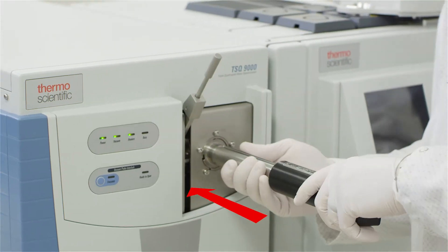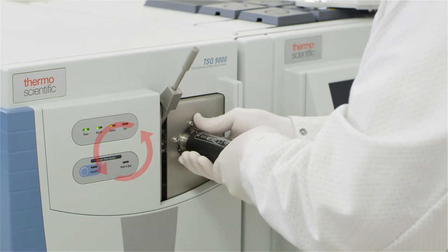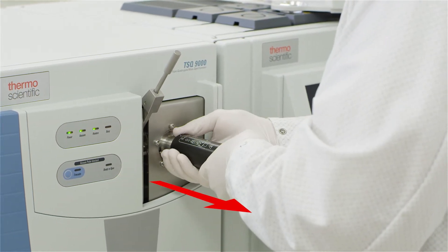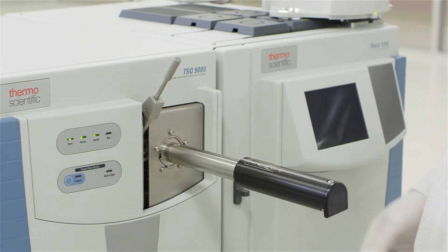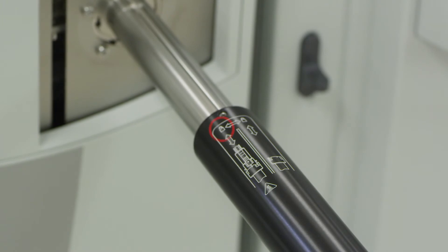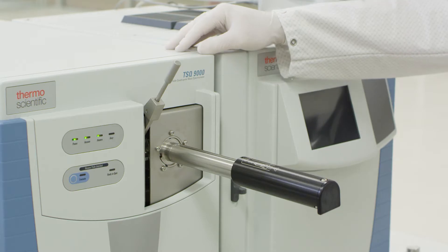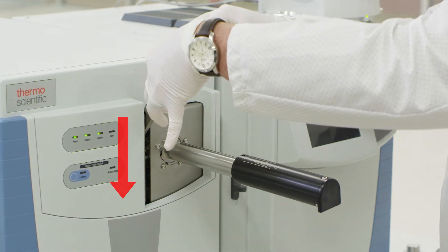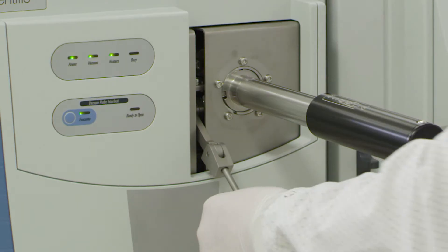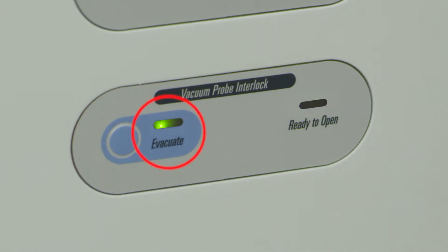Now you may insert the source installation tool. Turn counterclockwise and pull back but do not remove. The source cartridge is now attached to the source installation tool. The channel guide is now in the unlocked position, or left channel. You may now lower the lever, closing the interlocked door, and unscrew the lever arm. The evacuate light is now green again.